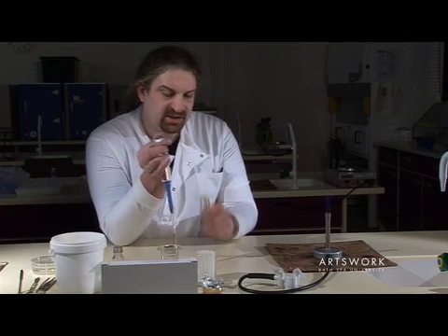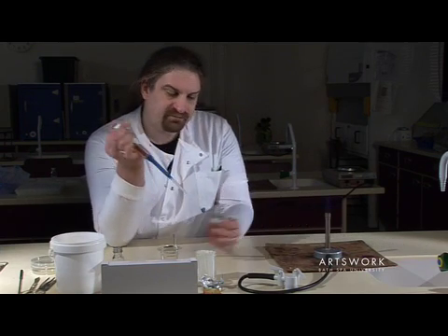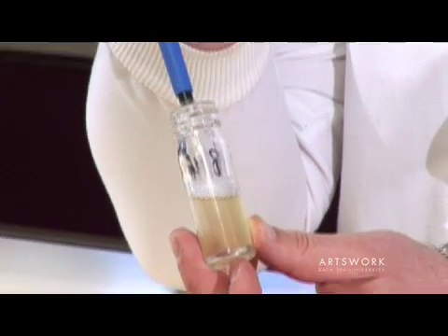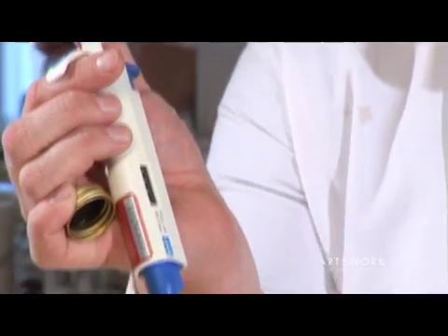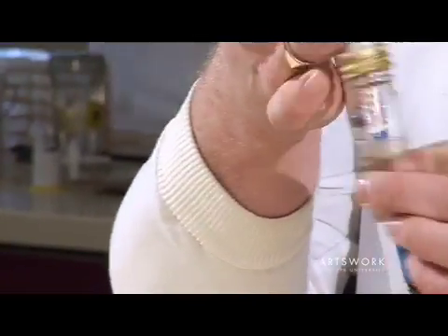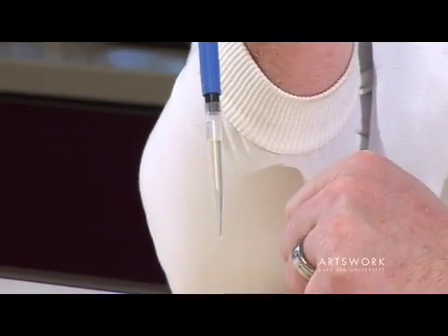Depress the plunger to the first stop and hold it, then put the pipette into the liquid and slowly release the plunger — that will draw up the liquid, in this case one millilitre, into the pipette. You'll see it almost fills up to the top of the tip.